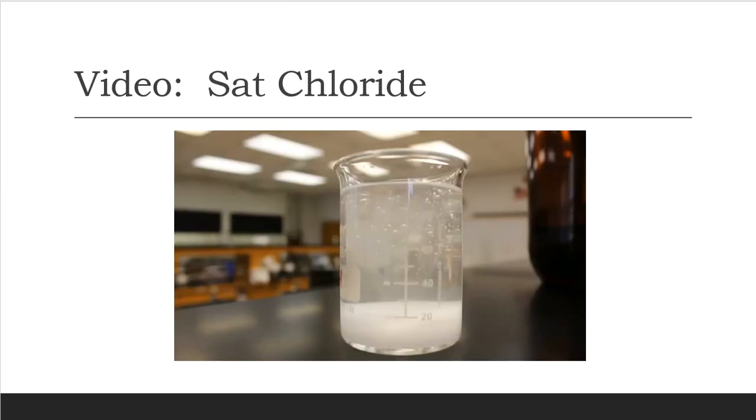All right, so now that I've washed it with thiosulfate to remove most of the color, I'm now going to add our saturated sodium chloride solution to it. All right, so let me show you what happens when we make the saturated sodium chloride solution and when we add the saturated chloride solution or salt solution to the separatory funnel.